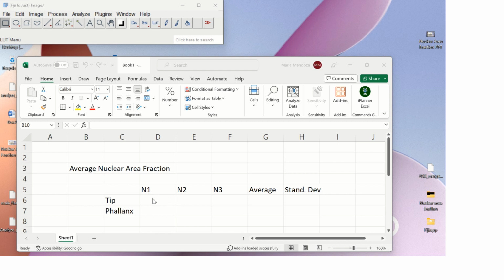And then we'll probably do, I think we have about 10 cells per experimental condition. So we'll take the average of that and put it inside of each N. And then we're going to take the average of that, and then do the standard deviation. And then once we have all of our numbers, we can proceed to downstream analysis.